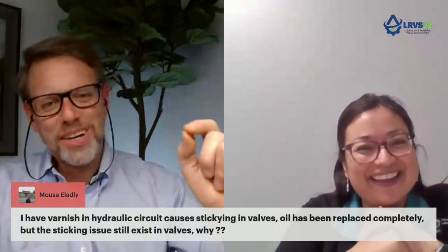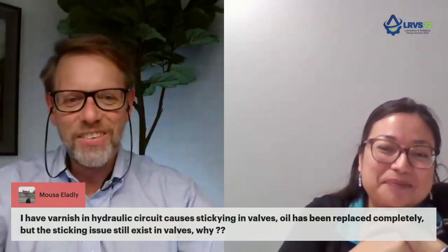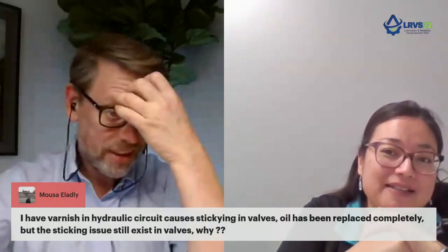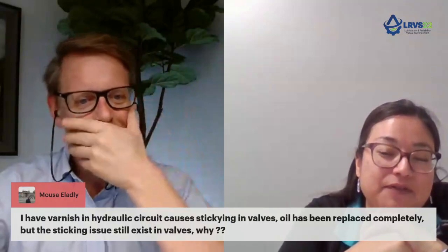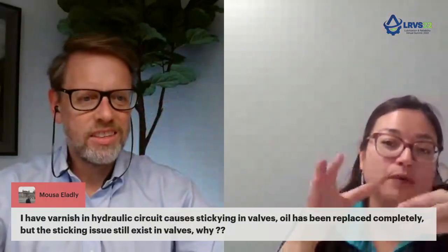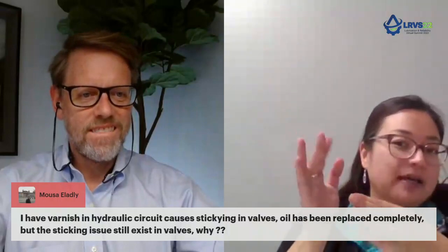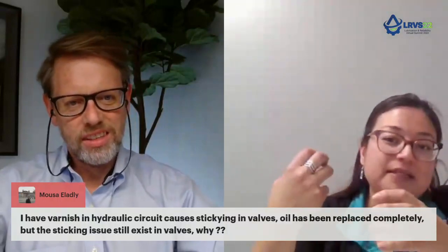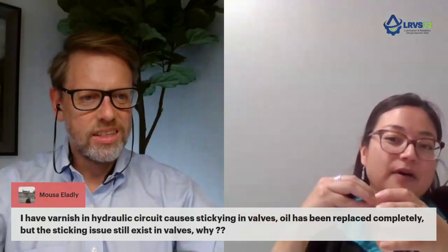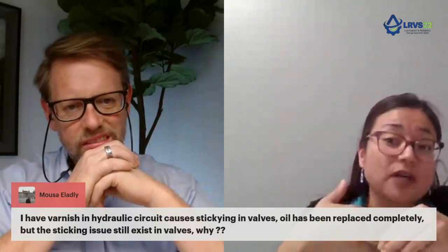This is such a common question, so I'm so grateful that someone asked this. So, what are your thoughts on this? Well, my thought is we haven't gotten to the root of the problem. If you're not cleaning the system and removing the varnish fully, by just removing the oil and not cleaning the system of the varnish, basically new oil over time is going to be contaminated with varnish, and the whole cycle starts.